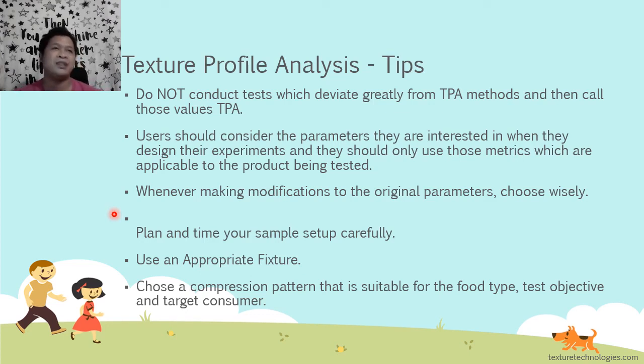I had to submit samples maybe 2 or 3 times kasi they had to find the right combination nga ng probes, the right sense ng mga parameters, and then they had to even recommend how my sample should be na parang itong unang sample na sinubmit mo, hindi pwede to, senseless yung data na nakukuha namin kasi pag pinush siya ng probe, nagde-deform siya, tapos kailangan mo gawa ng paraan na ma-contain siya, and thus the origami banana leaf box was born, no? Okay, use of appropriate fixtures.